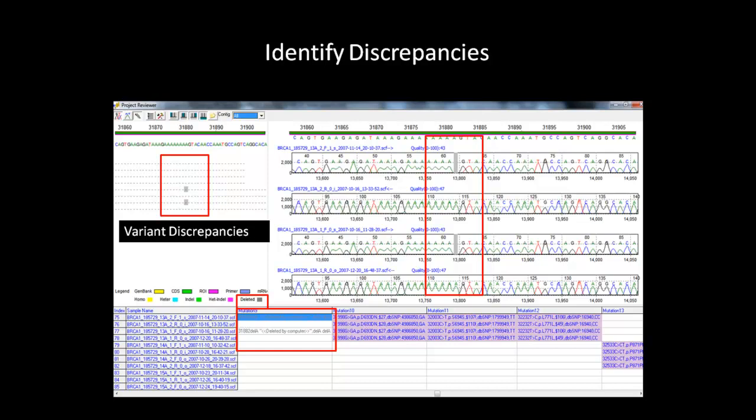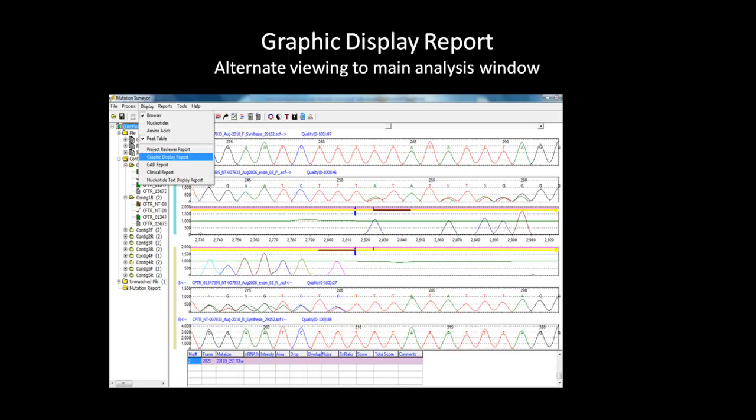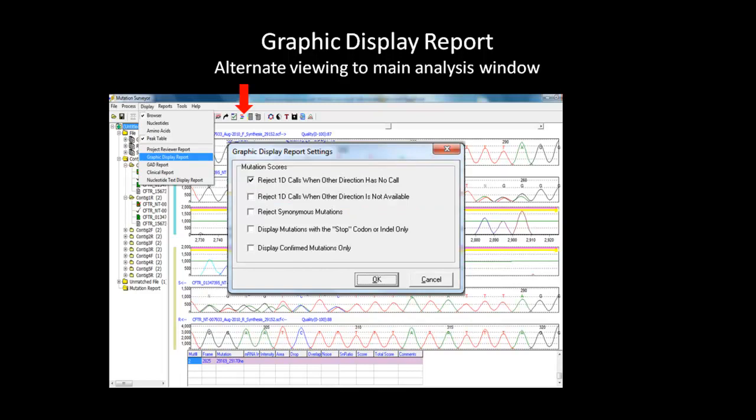This function can also be used to confirm variants. If a variant appears in all replicate samples, it is most likely a real mutation. Another alternative view to the main analysis window is the graphic display report. It can be used to review sample alignment and mutation calls for a contact. The report can be opened from the Display tab on the main menu toolbar or by selecting the graphic display button on the main analysis display window. A dialog box will appear with a few display options to choose. The first two options involve actual mutation display. Display only mutations with two directional calls will give the results more confidence than mutations called only in one direction. The last three options pertain to specific mutations such as synonymous, stop, or indel, and confirm mutation only.